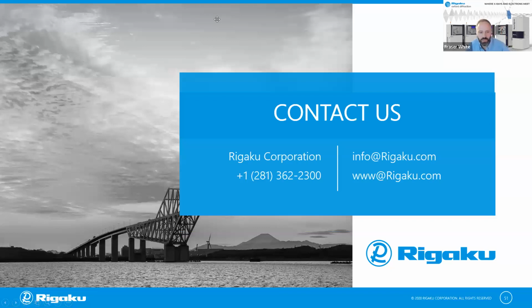Thank you, Jakub. Maybe just before we finish up, you could say something briefly about the mounting of the powders on the Synergy. I saw in some of the pictures the Kapton tubing as well as the loops. Yeah. So if I know that I'm measuring at low temperature, I will very often just use loops, dual-thickness loops or Kapton loops that sometimes have more contact surface, because if I can freeze the sample, then it will hold.